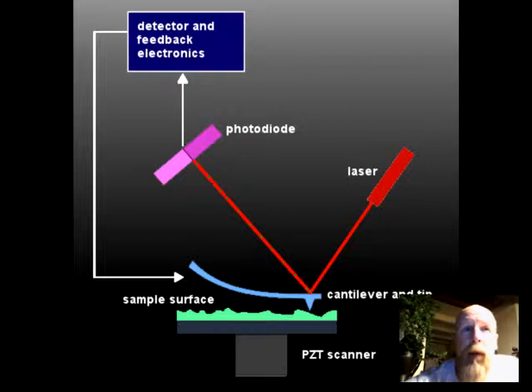When the probe comes within proximity of the sample surface, certain forces, depending on the situation, cause a deflection of the cantilever. Depending on that situation, those forces could be mechanical, contact, van der Waals, capillary, chemical bonding, and or electrostatic forces. The deflection is typically measured by the reflection of a laser beam pointed at the top surface of the cantilever, which is received via photodiodes. The frequency in which the diodes receive the reflection tells the detector how to send feedback information to an imaging monitor. In general, the AFM can operate under three different imaging modes: contact or static mode, non-contact mode, or tapping mode.